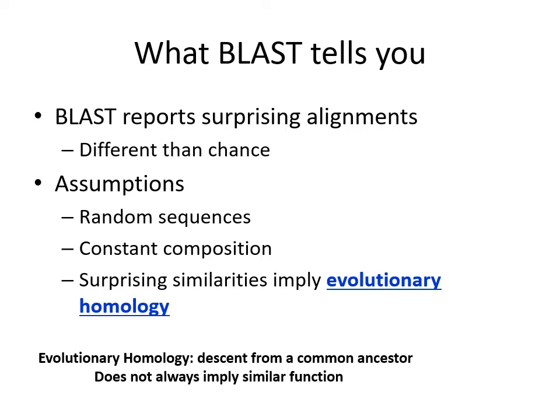So using this method, you can find all sorts of surprising alignments that you wouldn't have expected. For example, we know that we have algae DNA, but what if when you run that through the database, a hit comes up that matches a fungus? Oh, that's interesting. So somehow that fungus has ribosomes that are somewhat similar to algae ribosomes. I'm not saying that's going to happen. I'm just using that as an example.